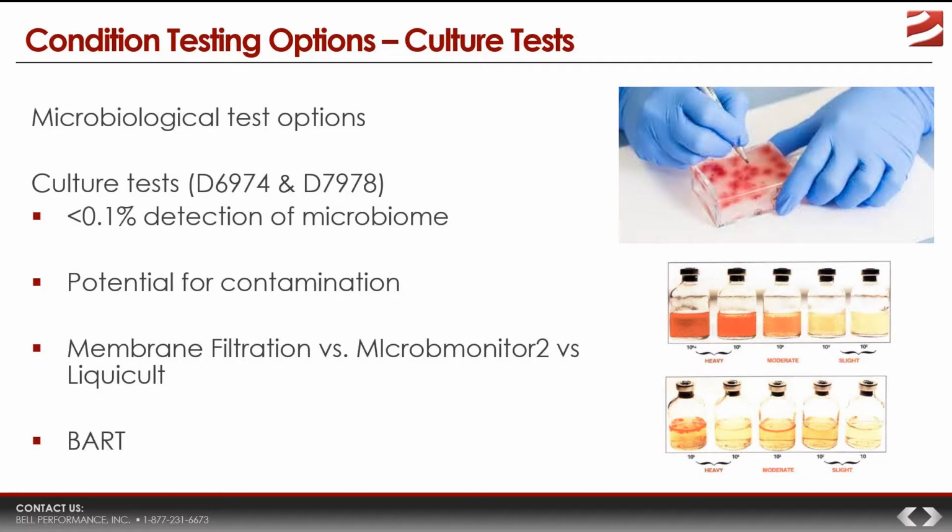Now, you let them incubate. They're all multiplying. But remember, not all microbes grow at the same rate. Some grow fast, some grow slow. So what happens if, say, those 2 hitchhikers grow twice as fast as the other cells? You let that happen over 30 generations, and you're going to have 1 billion microbes. But how many of those were actually in your sample to begin with, and how many came from those 2 cells at the beginning that grew twice as fast?